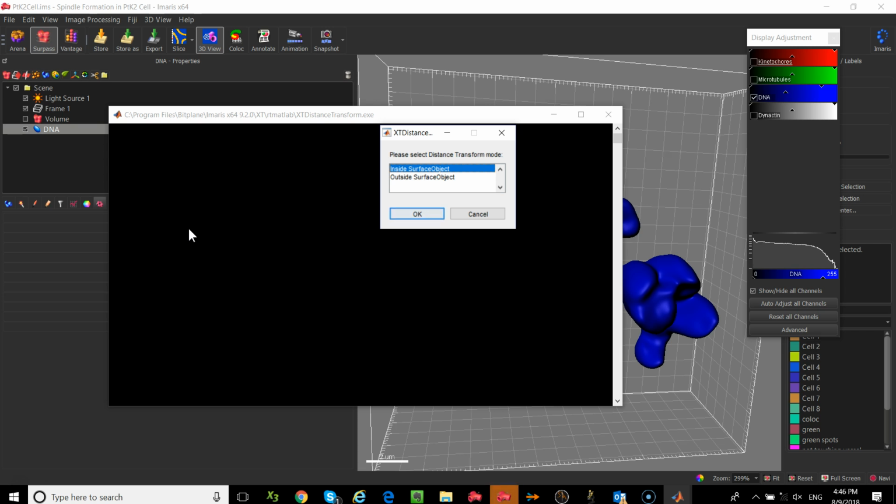If you click it a million times, it'll keep showing up. Okay. Especially if you full screen, you might go back to the original page, so unfull screen Imaris, and you'll probably have like a million versions of that letter. So you might need to click on it. Has it actually opened up this dialog for anyone yet? If you full screen Imaris, it won't. It's back in the original page. So take it out of full screen.